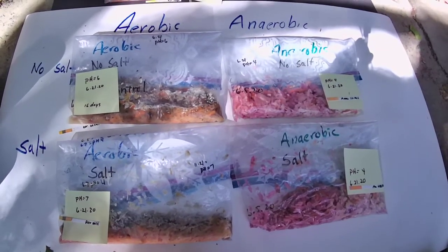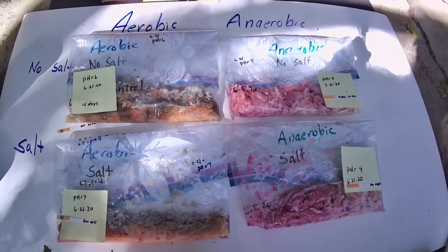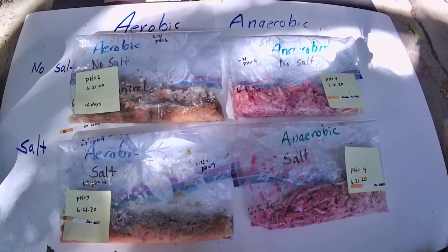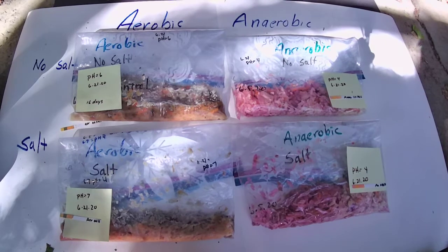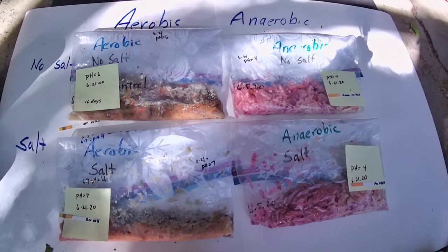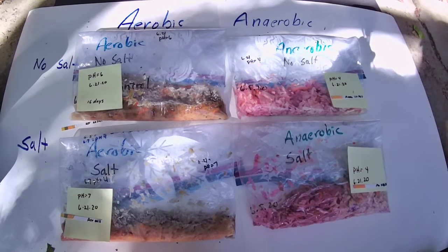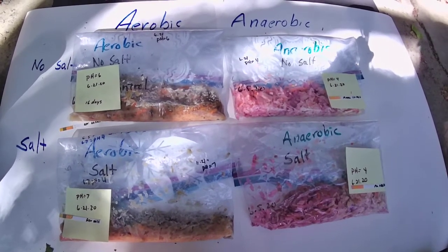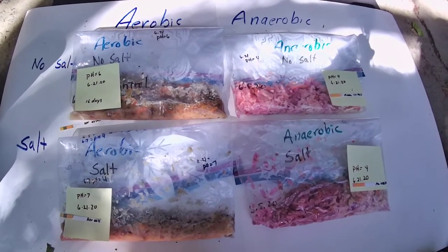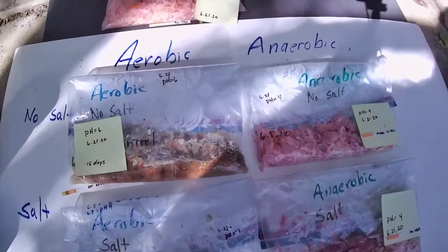So we'll try to make this short, you guys. We'll just look at the appearance and check the pH. And then after this video, I'll plate samples from each of the 4 treatments onto TSA and Sabouraud's dextrose media. Remember, TSA is all-purpose. It'll select for both bacteria and fungi. The Sabouraud's dextrose is going to select for fungi, which would include our yeasts and our molds, and we'll see if we have different microbial communities there. We also did gram stains, and I'll make smears from each of these. We'll gram stain them, and then we'll do one video just trying to summarize the gram stain results and the culture results. Okay, so first of all, you guys, and again, I'm learning how to use my little webcam here.